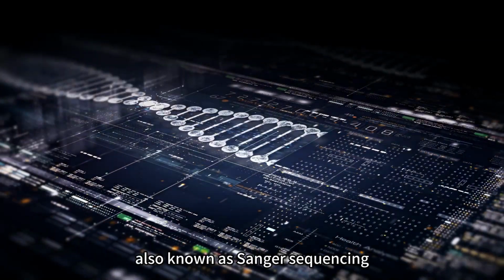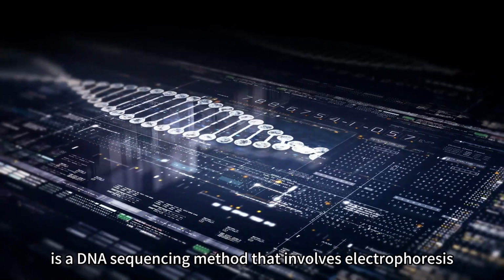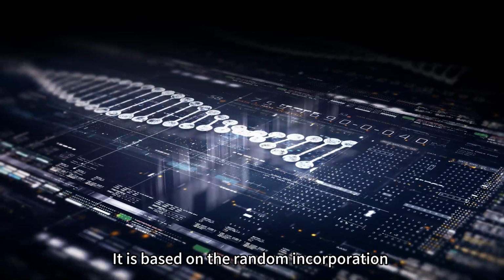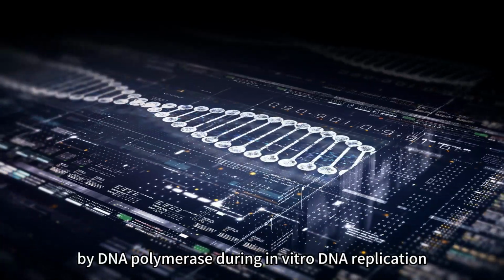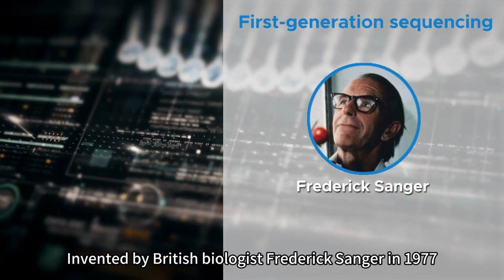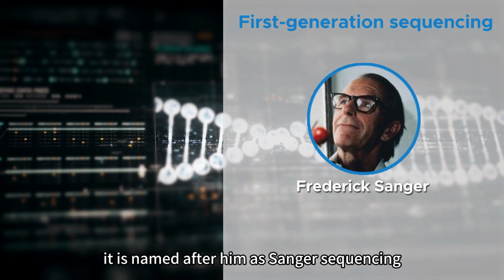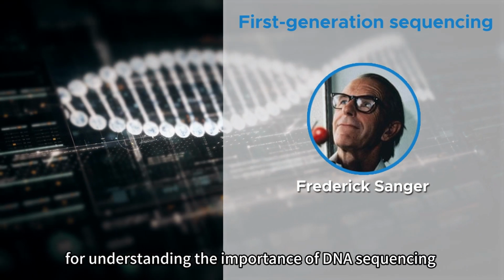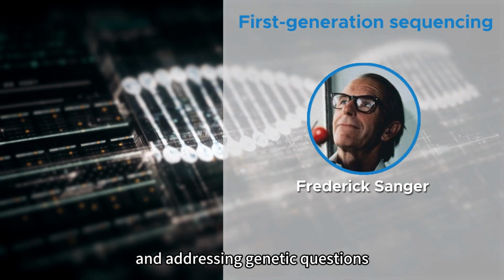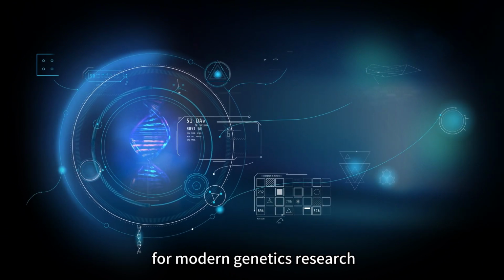First-generation sequencing, also known as Sanger sequencing, is a DNA sequencing method that involves electrophoresis. It is based on the random incorporation of chain-terminating dideoxynucleotides by DNA polymerase during in vitro DNA replication. Invented by British biologist Frederick Sanger in 1977, it is named after him as Sanger sequencing. This method has provided a powerful tool for understanding the importance of DNA sequencing and addressing genetic questions. Sanger sequencing laid the foundation for modern genetics research.